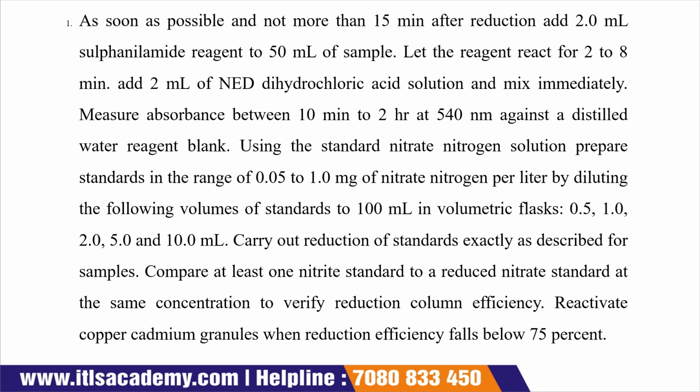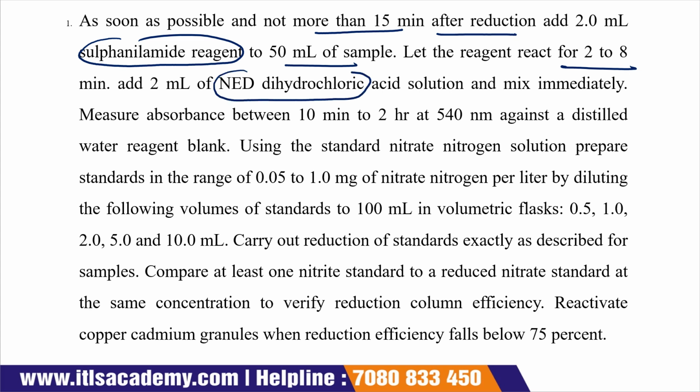Now, as soon as possible and not more than 15 minutes after the reduction, you have to add 2 ml of sulfanilamide reagent to 50 ml of sample. Then after that, you have to keep it for 2 to 8 minutes so that the reagent will react with the sample. Now after that, you have to add NED dihydrochloride solution into it, and the amount of this NED dihydrochloride is about 2 ml.